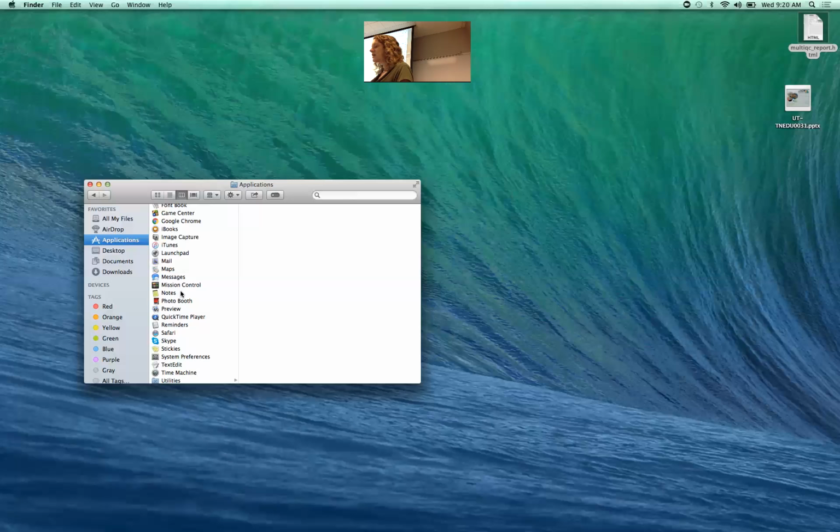Same for the per sequence quality scores. We see a little bit of differences at the very last base, but that's it. So very consistent.